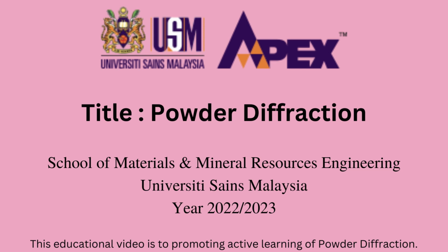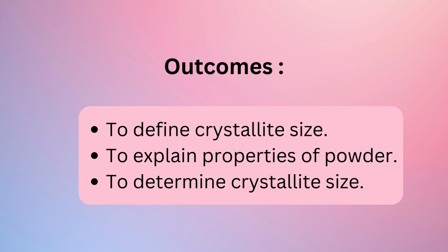This educational video is to promote active learning of powder diffraction. The outcomes for this topic: 1. To define crystallite size. 2. To explain the properties of powder. And 3. To determine the crystallite size.